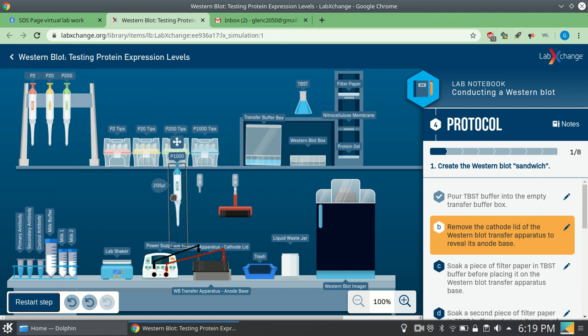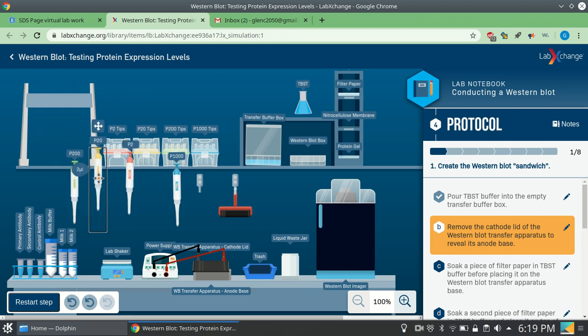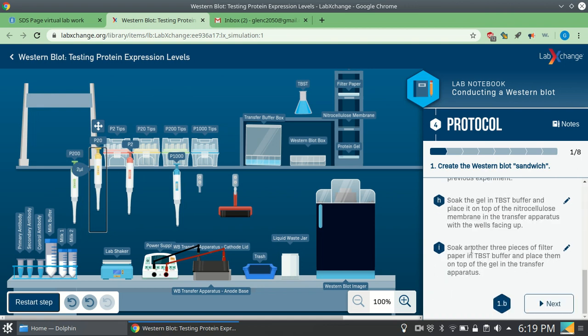And some of these lab tools, they could be wherever you want. It won't affect your results. But you got to show me the actual results, and those bands need to be correct, right? And you got to show me your little email address tab here, okay? So this is quite tedious, but not half as tedious as doing the actual lab work is. Although doing the actual lab work is more fun.